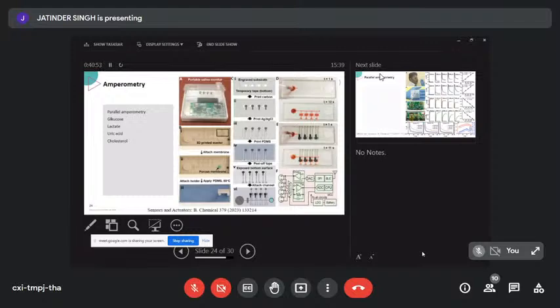You can also make a whole lot of them, and here we have a nice array of electrodes where we started off making a template with a 3D printer, put a membrane in place because we want to do some filter step, and poured some PDMS over to make it into silicone rubber. Then we peeled that off, put a silver chloride electrode on, and did a whole range of other processing to finally get electrodes in a fluidic device all in one.